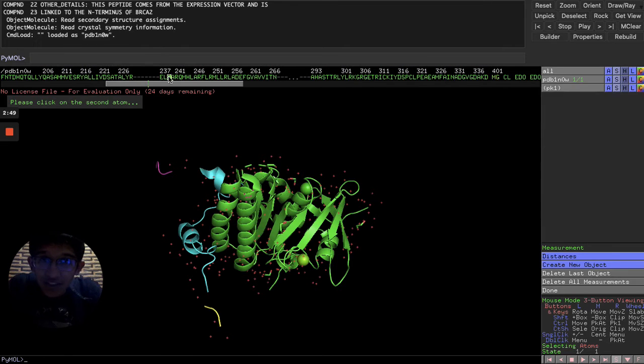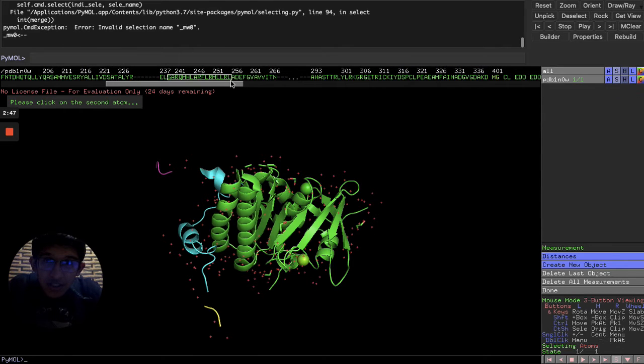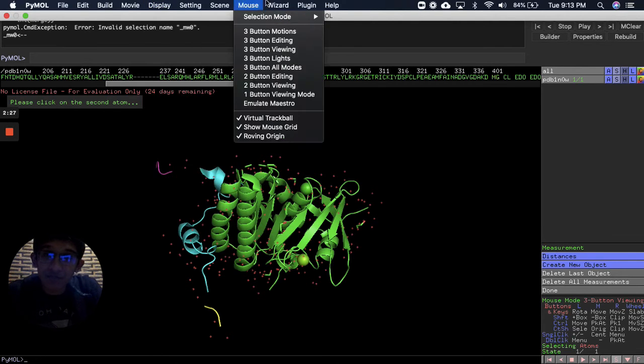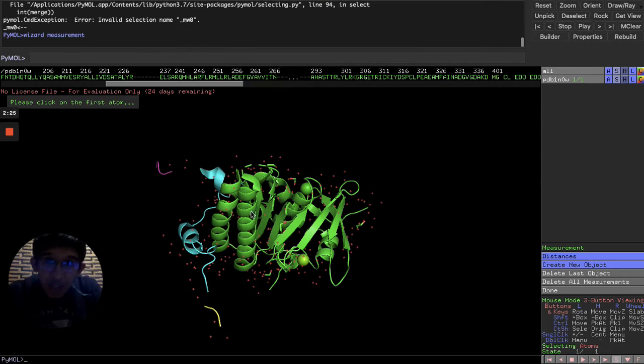And in these specific sections, we can even select certain parts of this section. As you can see, that thing that's moving is actually the selected regions inside of the protein. And that's actually pretty incredible because we can see which specific amino acids inside of this structure are actually there. Another thing that we can do is also calculate the distance. If you go to wizard and then measurement, we can actually find the distance between 2 different atoms.